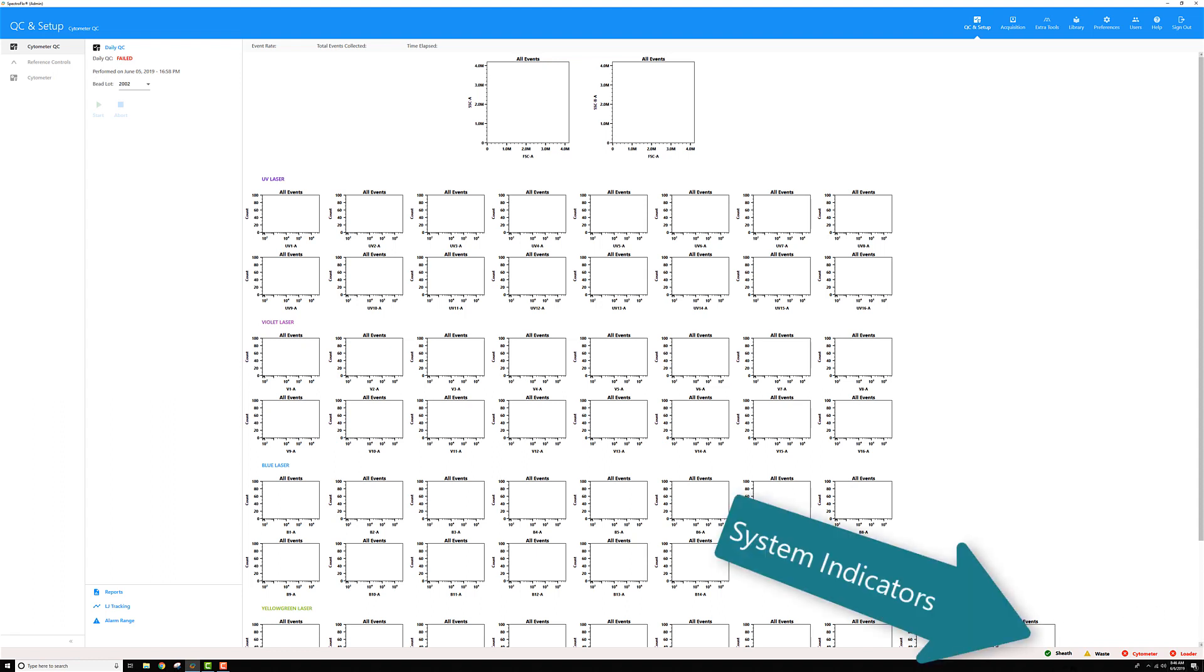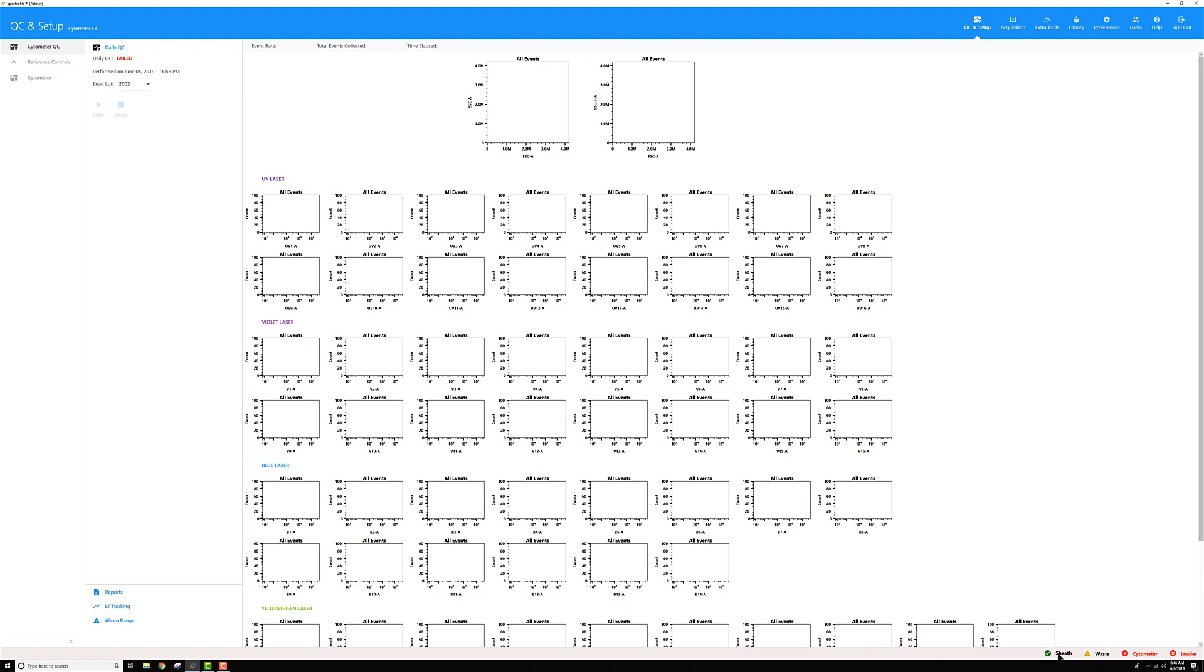So when the system's on, it'll check to monitor your sheath level and tell you if it's green check for full. If it's starting to run out, it'll turn into this yellow indicator here that you see next to this waste icon. If the sheath is nearing empty or the waste is getting full, then in front of them you'll get this red X icon that you see in front of the cytometer. Now my cytometer status is in red because it's not connected to the software because my instrument's off right now.